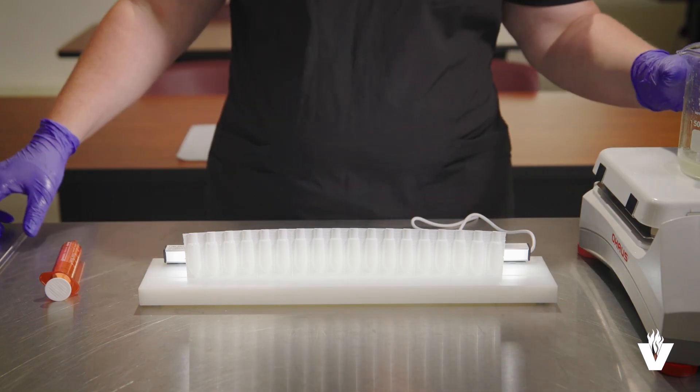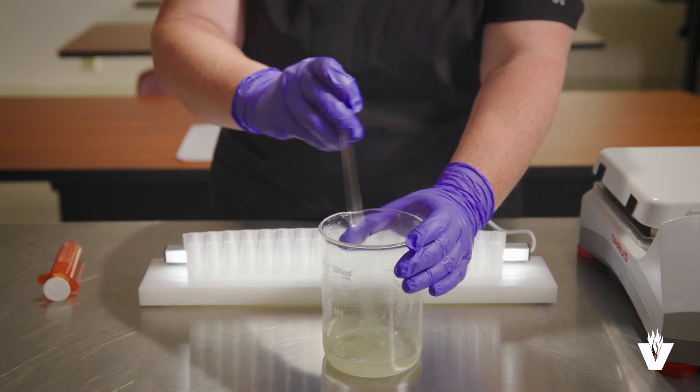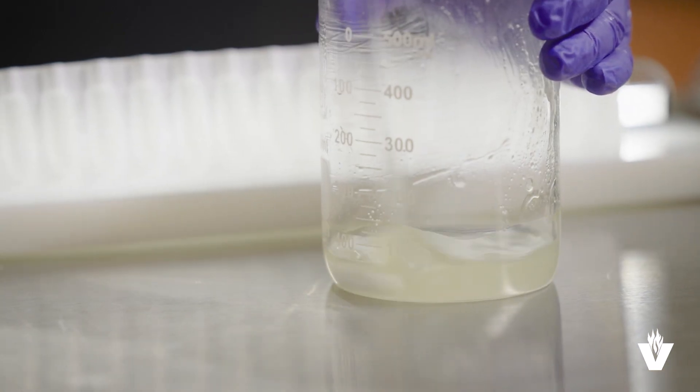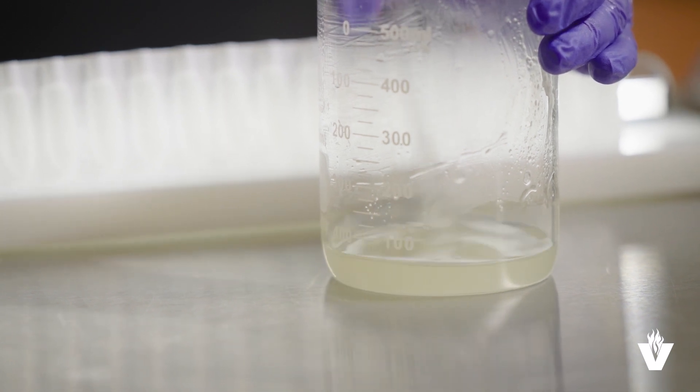Once dissolved, remove it from the hot plate and occasionally stir it with a glass stirrer as it starts to cool down. You must let this cool down so when it is placed into the disposable molds it is not so hot that it melts the mold.